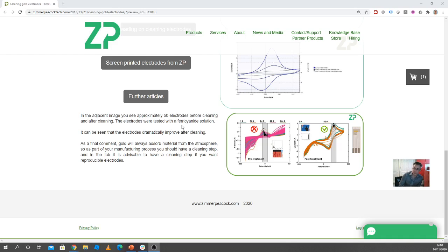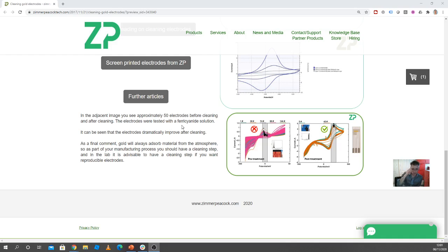And so even though it might look clean, there's a monomolecular layer on top of the gold. And you can see the effects as some distortion if you were doing cyclic voltammetry.